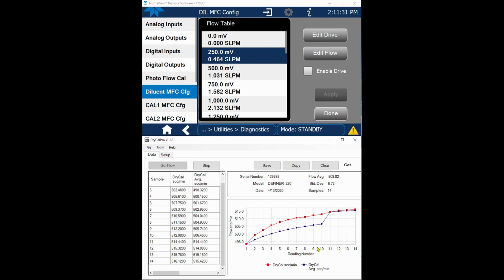See, this is getting a lot better here, so probably after this batch I'll go ahead and clear out my buffer here and start from scratch. Because right now we've added all of these points into our readings, even though we're in a burst mode of 10. Because I haven't reset this, we're going to have 20 samples in here. More isn't necessarily bad, but we just want to have a nice stable reading. So now we're starting to level out here.